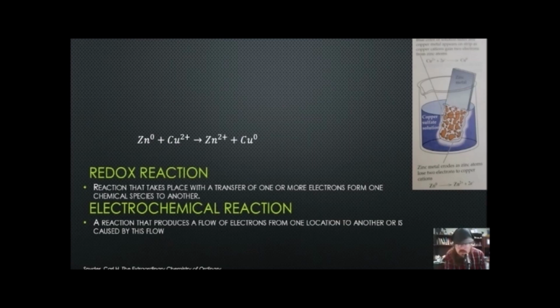Normally zinc isn't soluble in water, but zinc 2+ is. So how are we dissolving the zinc into water? The zinc is losing 2 electrons to form a soluble ion. The blue copper solution is absorbing 2 electrons to form the insoluble copper solid. It's absorbing the 2 electrons lost by zinc. And so what's happening when we put the zinc into the copper solution, copper sulfate, is the metals are directly replacing each other. And so we see the reaction.